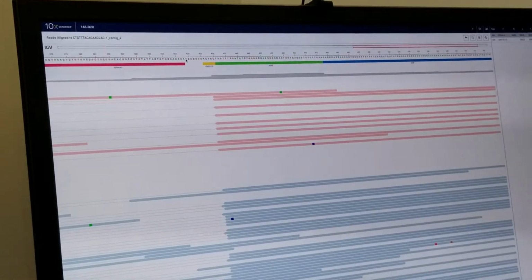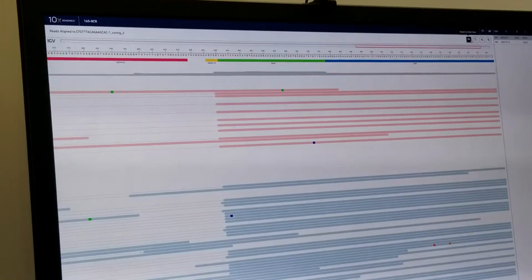I think this is the challenge for this kind of sequence, single-cell 10x. To me, it's a challenge because it's easy if it's not 10x, because then you've got to clone. But for 10x, you don't have a clone, and you just have these overlapping sequences. It's interesting, a lot of them start right here. The few that go through that region, yeah, it might be a little weak. I need to pull that sequence and just have a little image of it so I can see it, because I think it's this sequence here. It starts... Go back. Sorry.